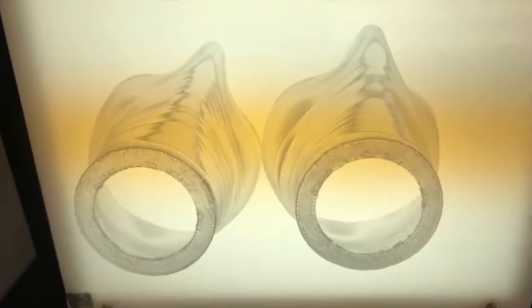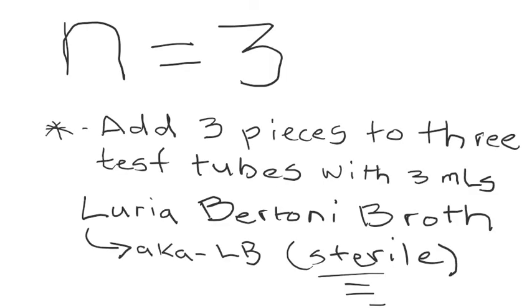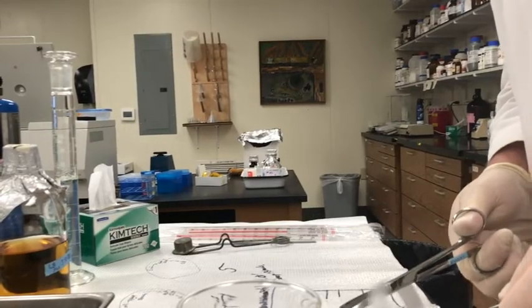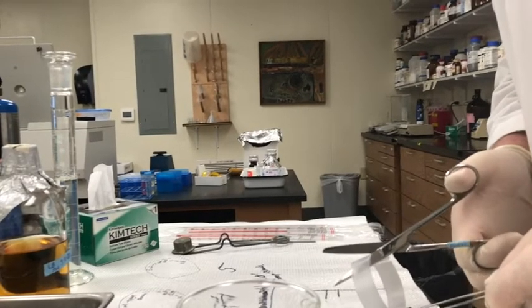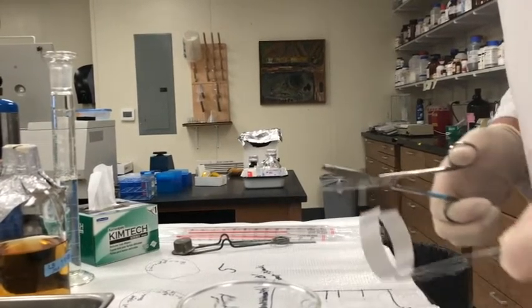Stage two. Woo! I'd like to dedicate this video to my aged father. The objective is to sterilize these 3D printed masks. Cut the single-walled 3D printed material into pieces. N equals 3.